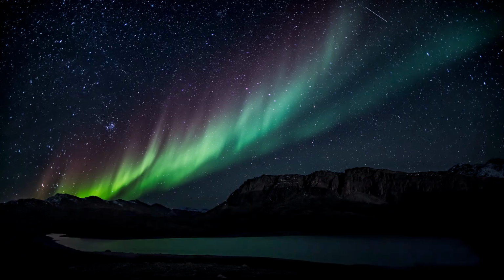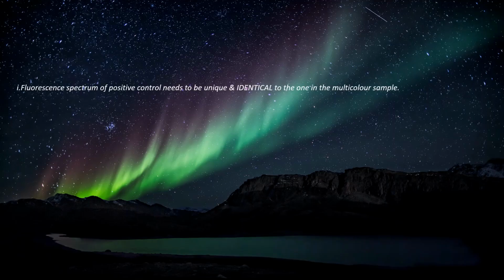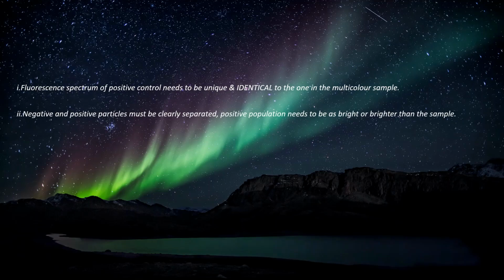So, here are 4 rules to follow when developing your reference controls. Number 1, the spectrum of emission needs to be unique and identical to the one in your sample. Number 2, you must ensure that your reference is as bright as possible and should be as bright or brighter than the sample.